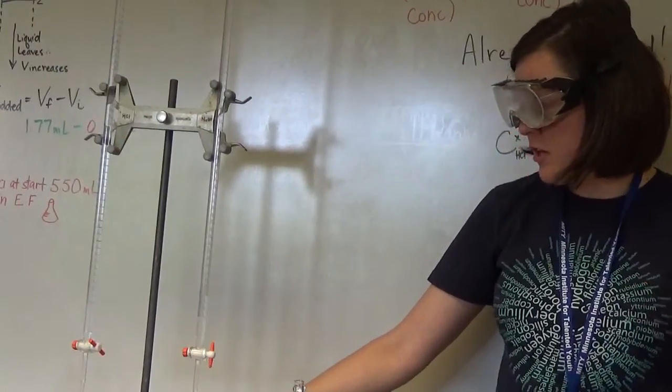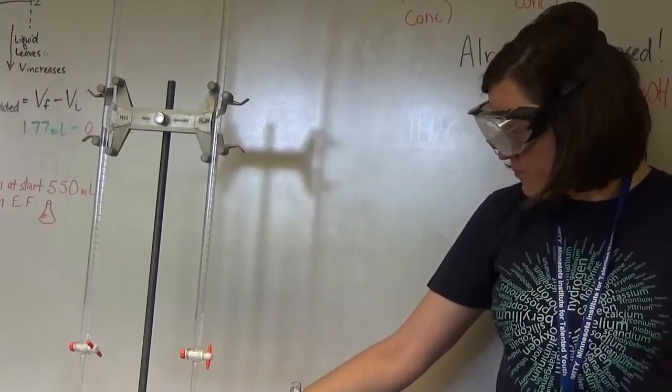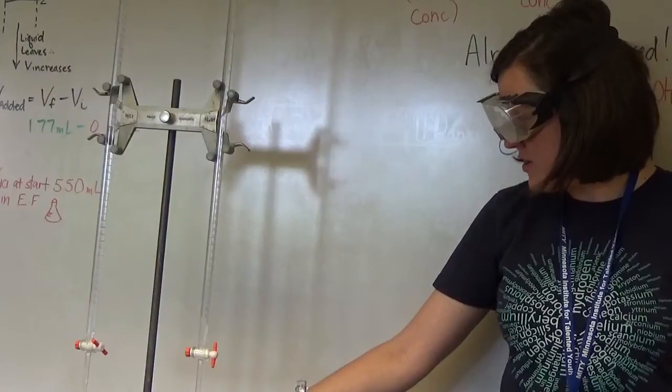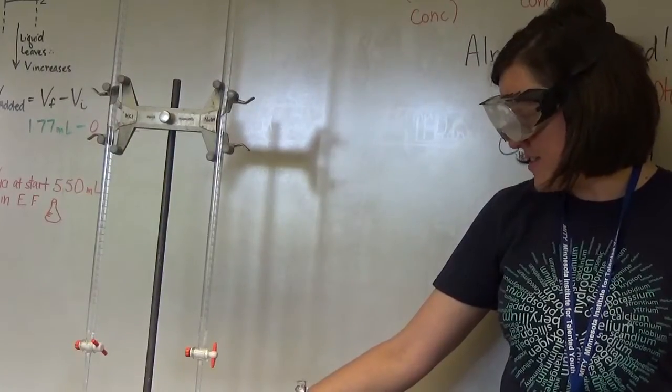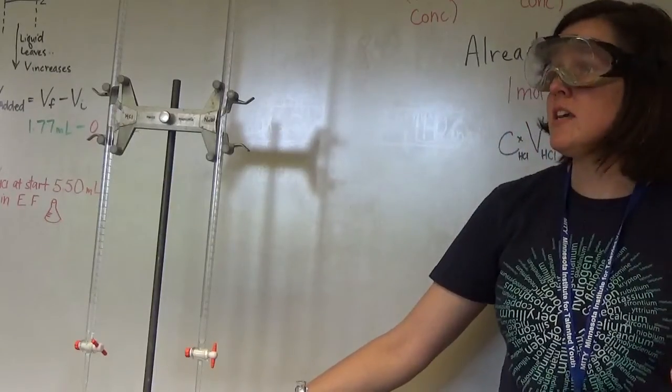And when you finish your calculations, you're going to turn your calculations in. Again, as a group, and you've got 2 to 3 people in your group, you can do multiple trials so that you get the best answers to get the best solution. And that's one of our competitions here.